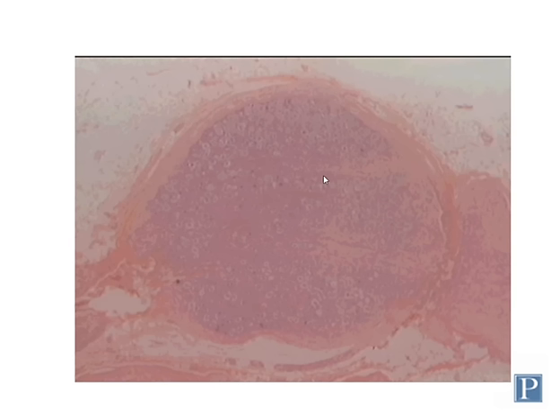So the nervous system in the PNS consists of nerves, which we've looked at, and also collections of cell bodies called ganglia. Nerves don't contain cell bodies, only axons and connective tissue and some other tissues. But there are cell bodies in some places of the peripheral nervous system, and those structures are called ganglia. Ganglia differ greatly in size and structure, so we're going to look at three different types of ganglia.